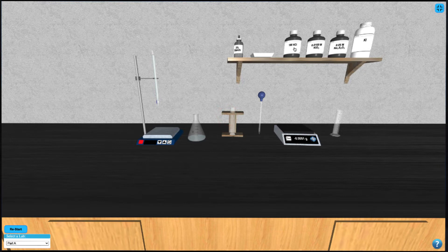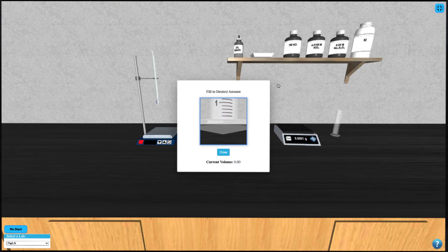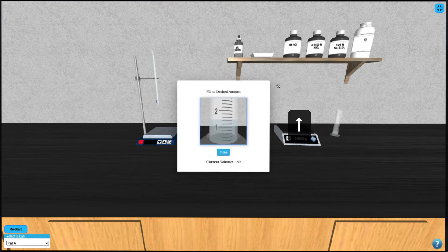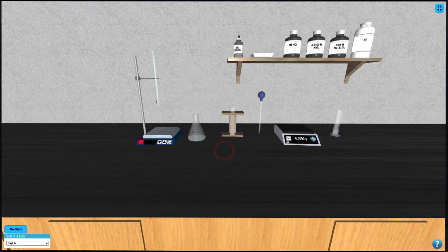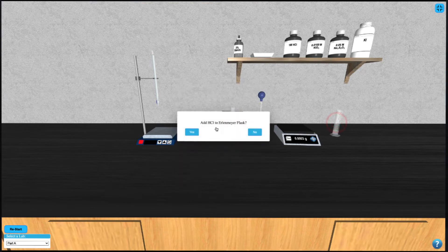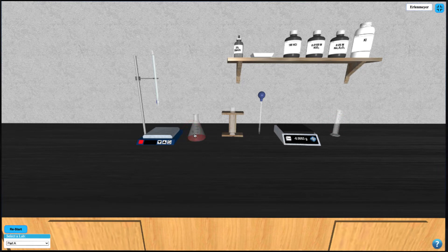Once the sample is dissolved, click on the HCl bottle to dispense some of the hydrochloric acid solution into the graduated cylinder. After filling to 2 mL using your up arrow key, you can add it to the Erlenmeyer flask by clicking on the cylinder.